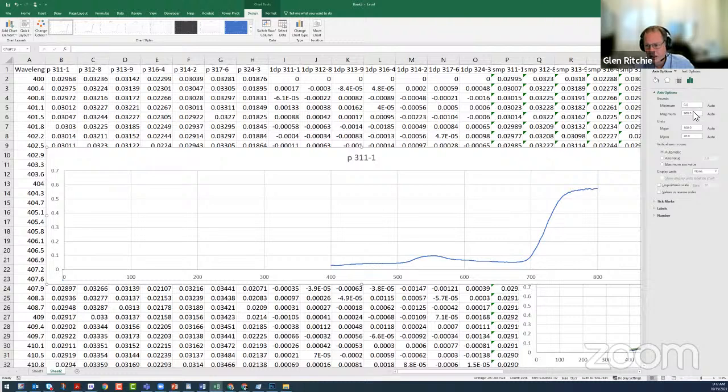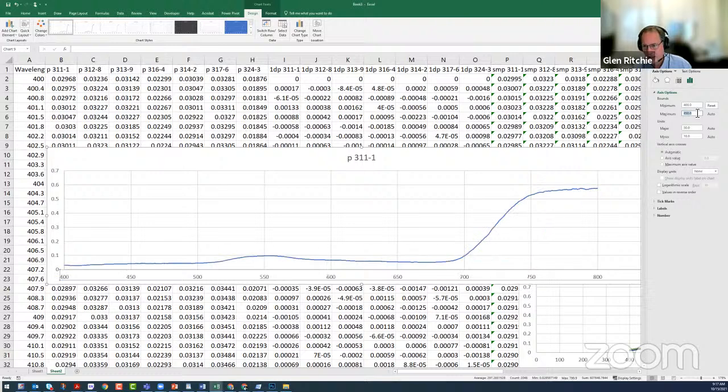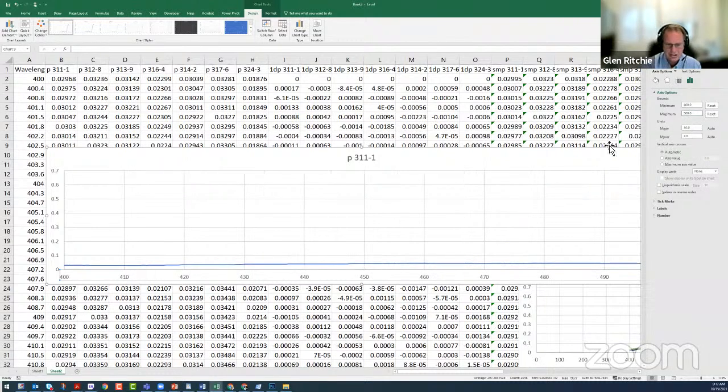If you're into electronics, a lot of times you start hearing about signal to noise ratio, and that essentially means that you have a lot of signal compared to the amount of noise. A high signal to noise ratio is a way of estimating how good your measurement's actually going to be.